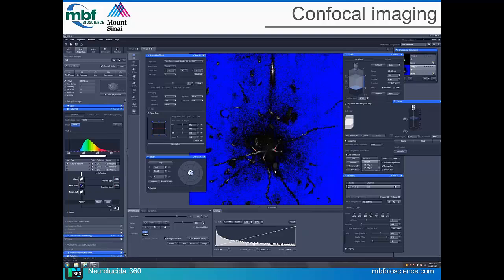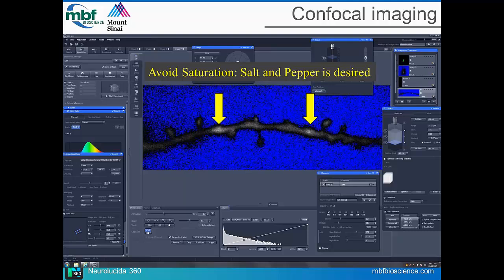You don't want that super saturation because you will lose a lot of information. Right. So when you're looking at this live, all of these blue pixels and all of these red pixels are sort of dancing across the screen, kind of like a snowstorm. So they're not indicating that they're fully saturated. It's an indication of sort of noise, I guess, right? Right. I call it the salt and pepper effect.